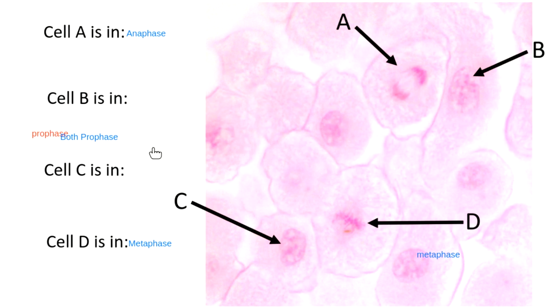These are our two examples of prophase for us. So you can see that genetic information starting to clump up inside here. So we're starting to see chromosomes form. Same thing here, I'm starting to see those chromosomes form. What I liked about this one is you can still definitely see the nucleus around the genetic information, see that purple line. Whereas this one, it looks like the nucleus is starting to fall apart because I have some spaces where I don't really see that nuclear envelope anymore. So both of these are an example of cells that are in prophase.